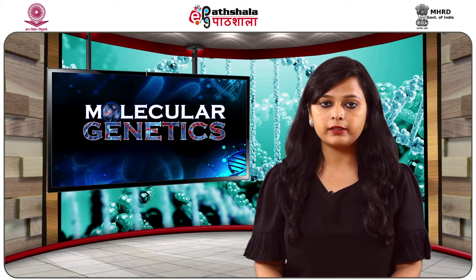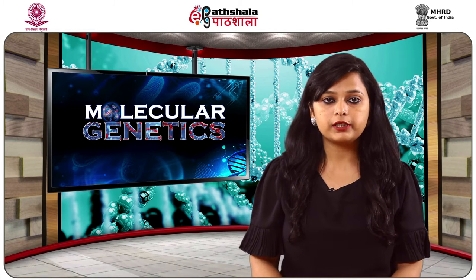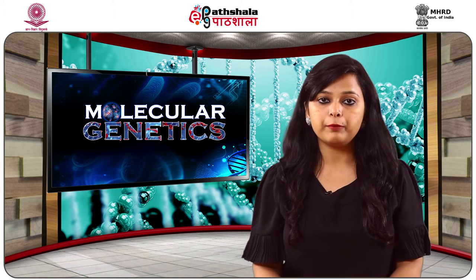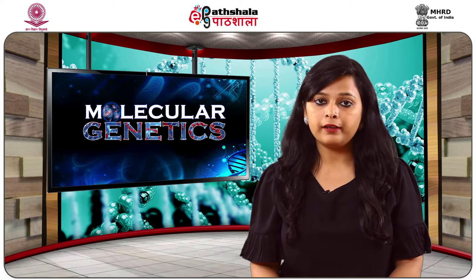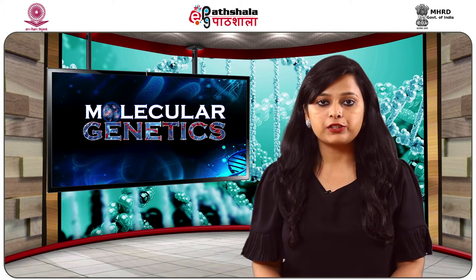In this labeling method, a visible colored precipitate product is produced. For example, initially a digoxigenin-labeled probe is used, which after hybridization with the target is exposed to anti-digoxigenin antibody fastened to an enzyme involved in catalyzing a colorimetric reaction.